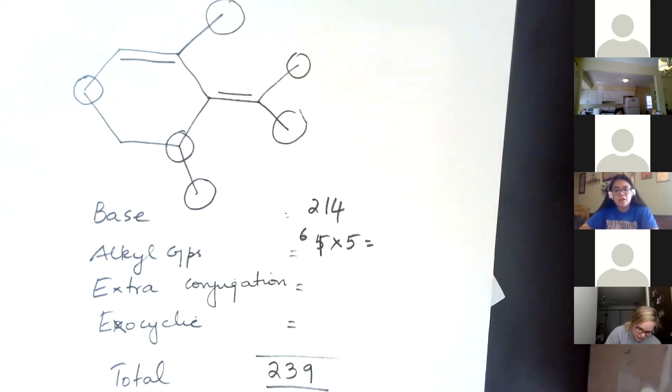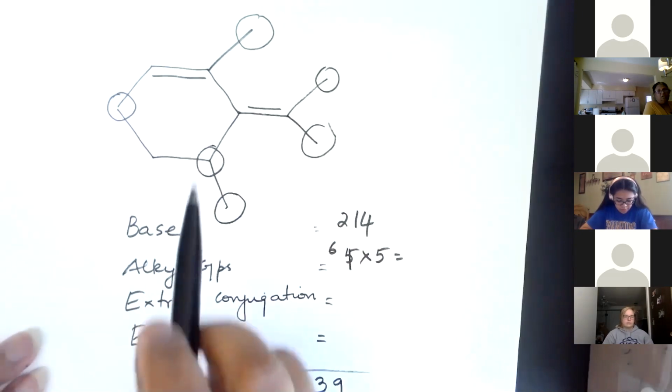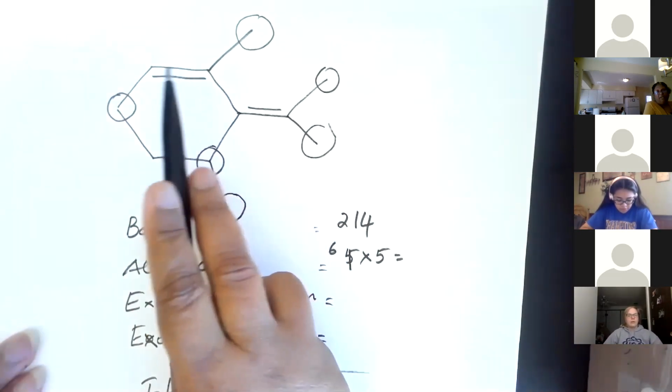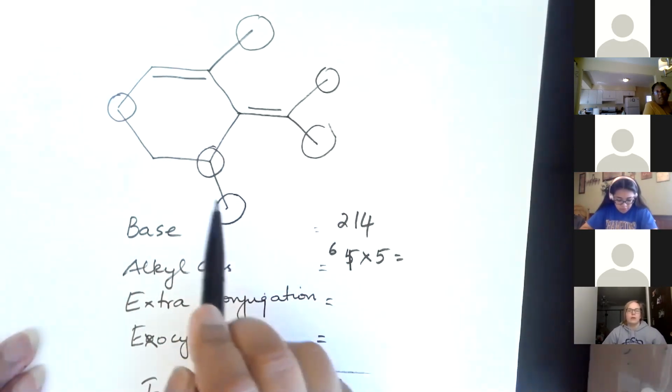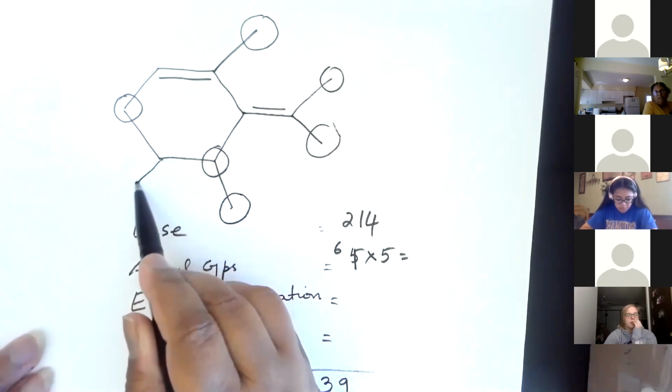The 6th one that you have, it's not a ring residue. Okay, that's not considered to be a ring residue. So you look at only those groups that are directly attached to the double bonds or the extensions of the double. So you don't do an extension of an extension. So the thinking was that this is a ring and that you have an alkyl group going outside of the ring. So if I have an alkyl group here, that's not considered either.